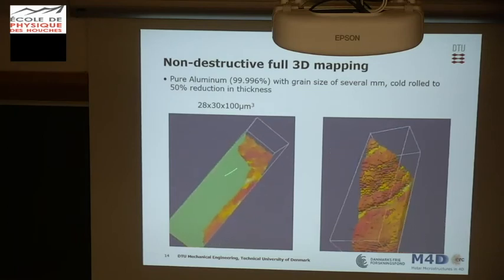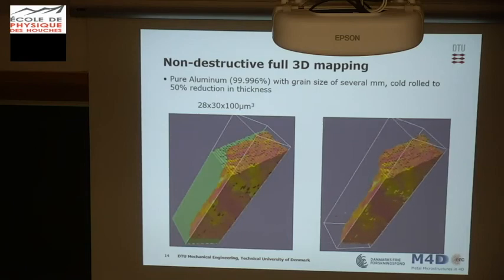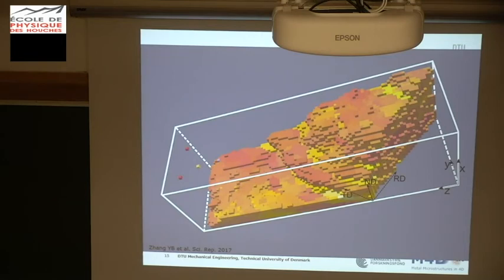If we make the matrix transparent to see the recrystallized grain, then you can see details of the boundary planes. If we look at this again, taking a close view, we see the boundary is not uniform. It contains staircases, some facets, some curved parts, and facets again. This is on a scale of 10, 20 microns, so it's not an atomic scale facet. This is a mark where the facets are, and those are the curved parts connecting the facets.